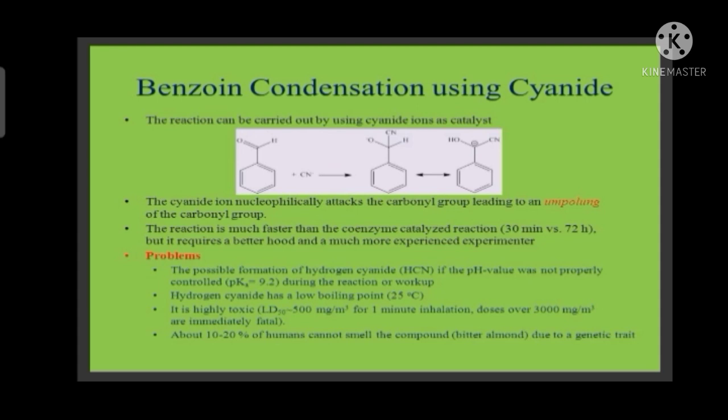The problems are: possible formation of hydrogen cyanide if the pH value was not properly controlled during the reaction or workup. If the pH value was not properly maintained or controlled, then HCN will form, and that is harmful to our health. This is a biggest disadvantage. Hydrogen cyanide has a low boiling point of 25 degrees Celsius, which is normally our room temperature, so it may be evaporated. It is highly toxic. About 10 to 20 percent of humans cannot smell the compound due to genetic trait.